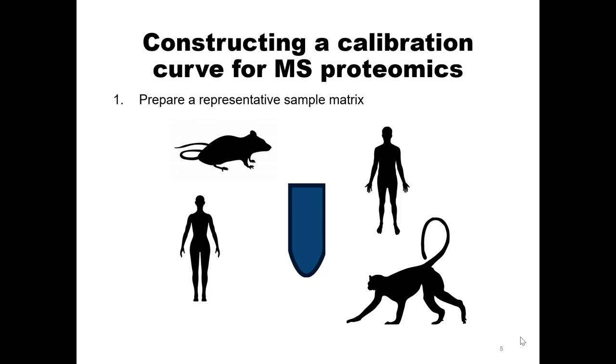One important note, if you look in the CPTAC guidelines, I know my first intuition was, well, I'll just make a big giant bulk sample matrix and just do a bulk digest and be done with it. One of the notes in the CPTAC guideline was that this might actually bias your results because the way things digest in bulk might be different from how they digest in a limited sample volume or a limited sample amount. So that was an interesting note that I wanted to make sure I told you in case your first intuition was the same as mine, and I said I'd just grow up a liter of yeast and digest a whole liter of yeast or something.